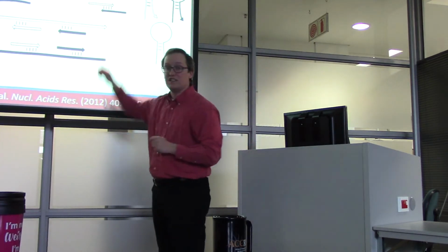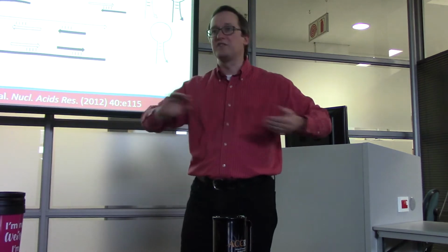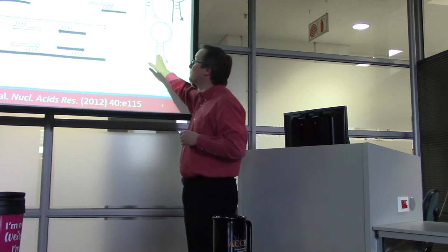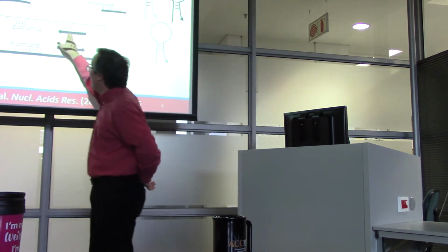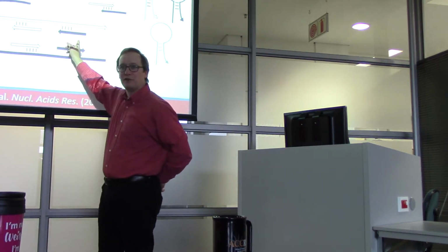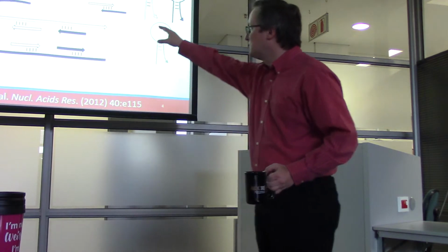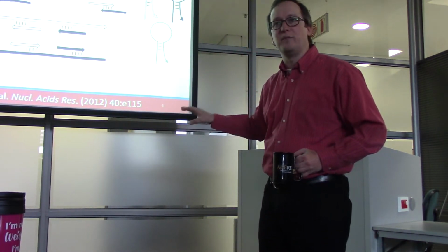We don't want end interactions where, maybe you don't have substantial homology within the sequence, but at the ends you do. That would be very bad, because you end up with interactions like that. You don't want the formation of hairpins like this. And you don't want to create situations like this where a primer from a different target interferes with the amplification of another one. So being able to deal with this class of problems gets very, very egregious.